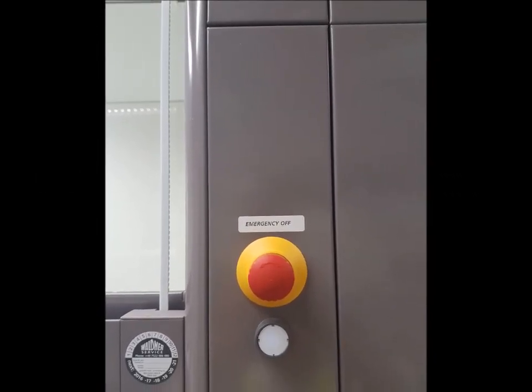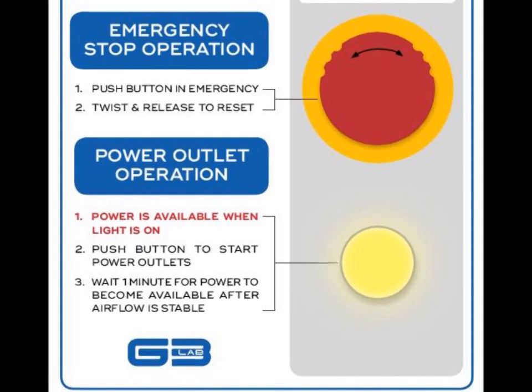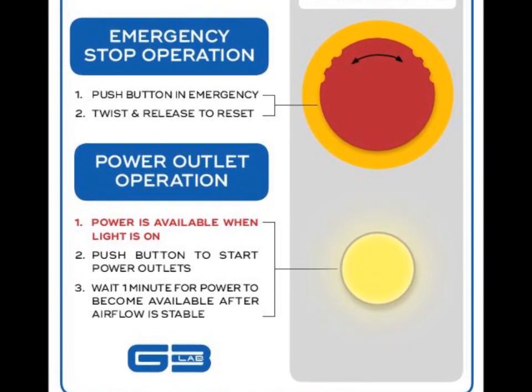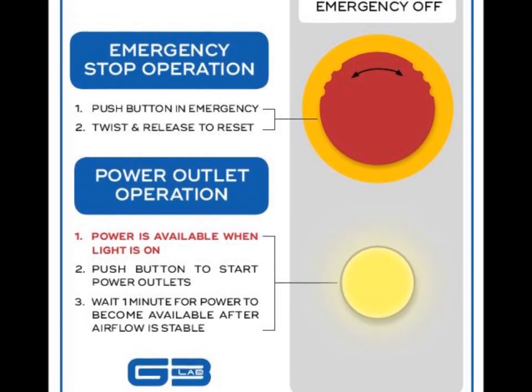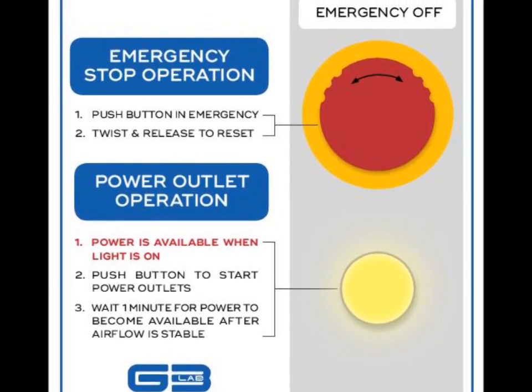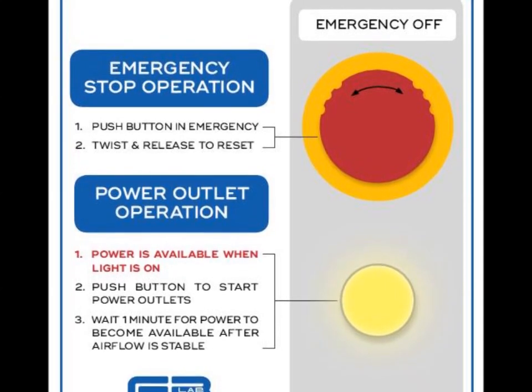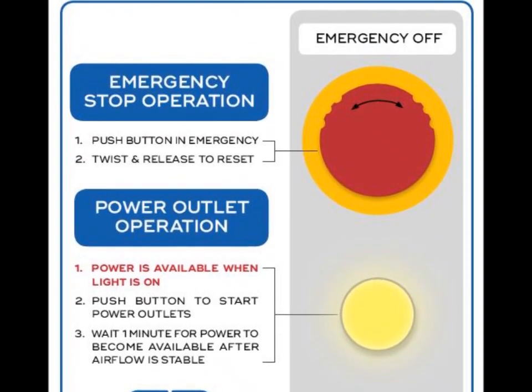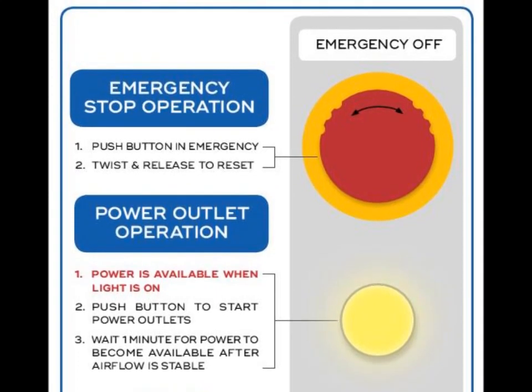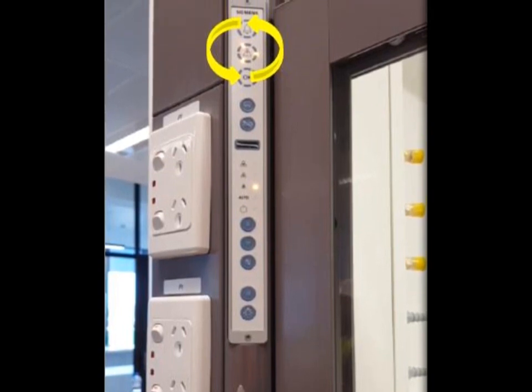Emergency Stop and Power Reset. The large red button is used to stop power and flammable gas, if fitted, to the fume cupboard in an unsafe situation. This includes, but is not limited to, a fire, electrical fault, or a chemical spill. Once the situation is resolved, the emergency stop button must be released by twisting, before power can be restored by pressing the power on button located immediately below. After pressing the power on button, the fume cupboard will start a one-minute delay to ensure safe airflow before power and flammable gas services, if fitted, are restored. During this one-minute startup period, a rotating yellow LED indicator will show at the operation panel.